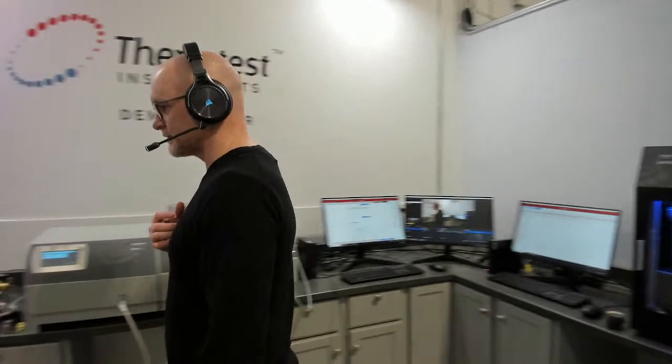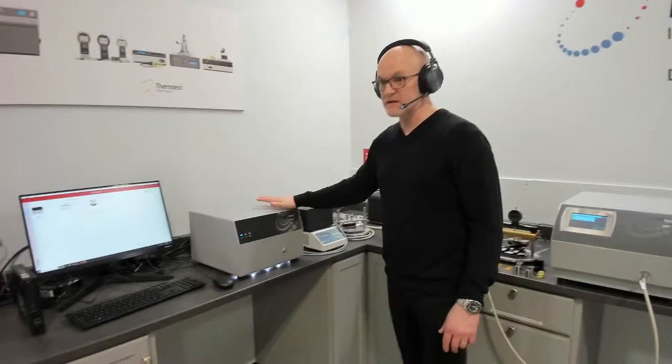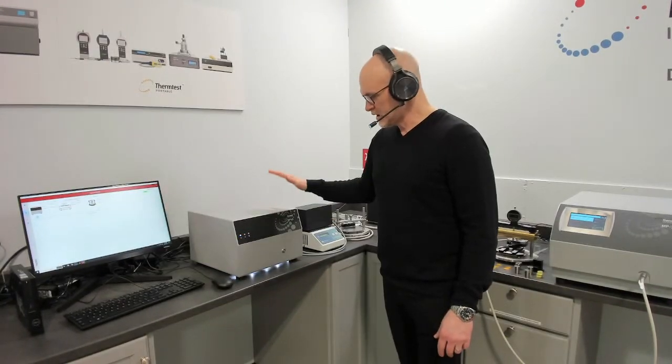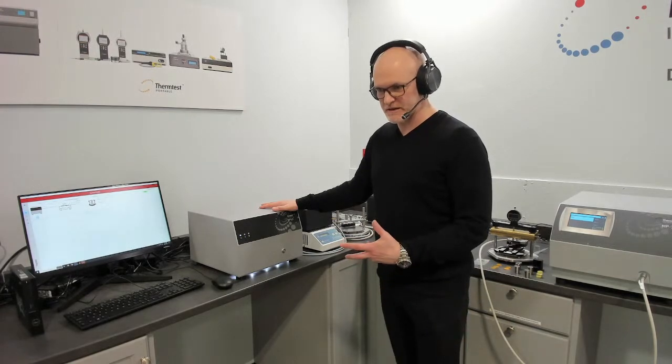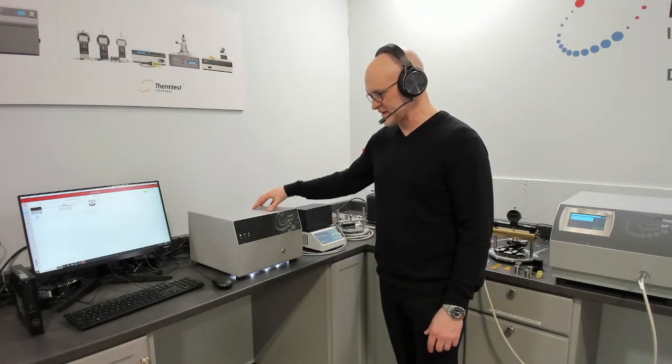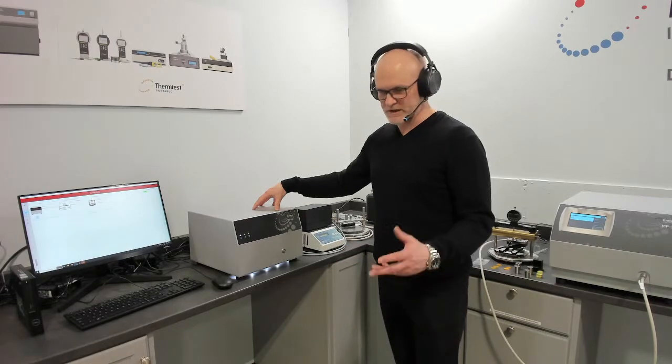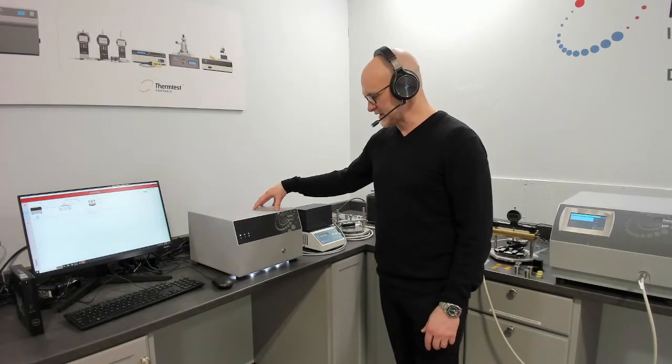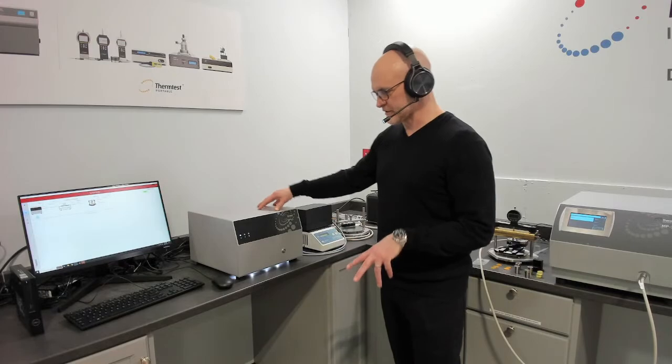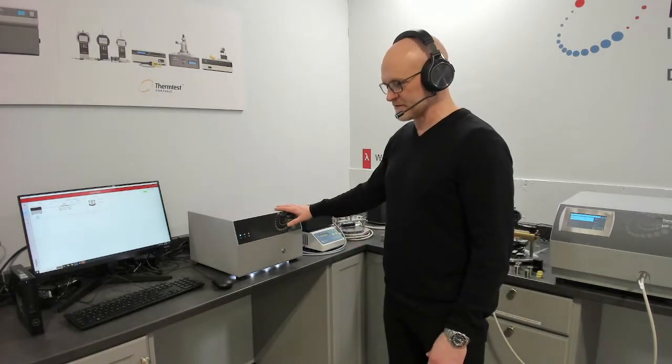Coming back to our TPS2 which we'll talk a little bit about for thin films. This is also a generalized method following ISO 22007-2 the year 2022 standard. This has an overall thermal conductivity range of 0.1 up to 500 watts per meter Kelvin.